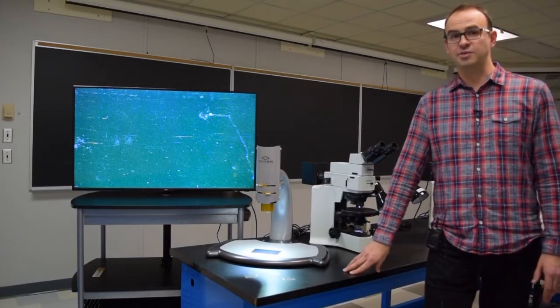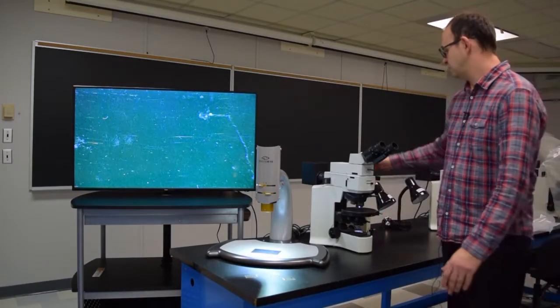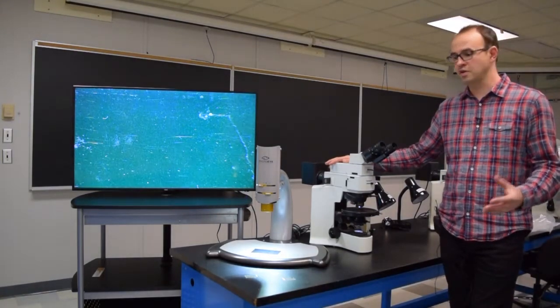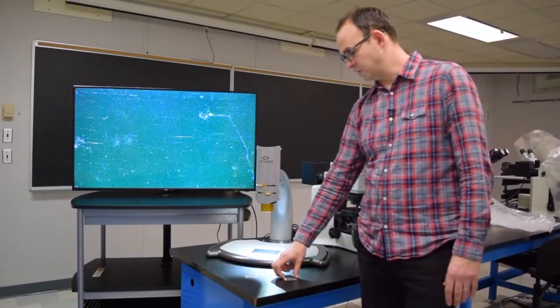Here we are in the optical microscopy lab, where we use scientific microscopes to describe rocks. We look at rocks in thin sections through these microscopes.